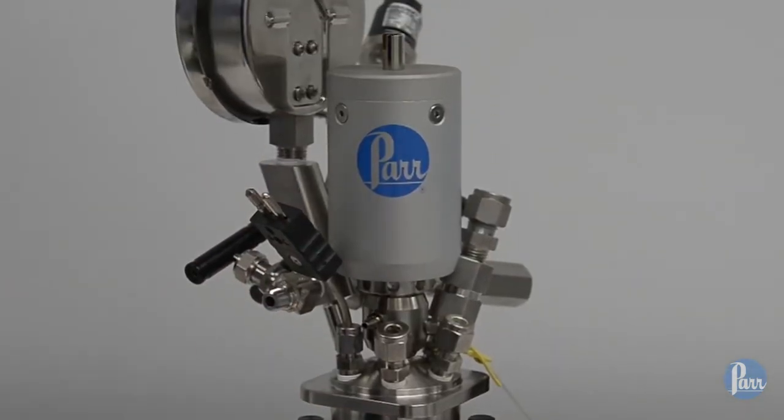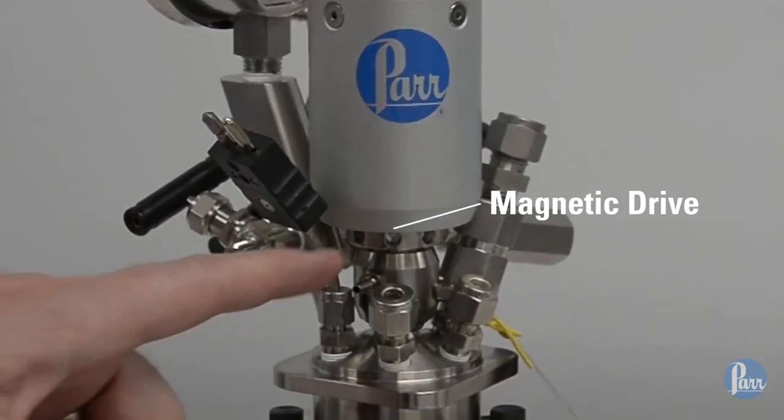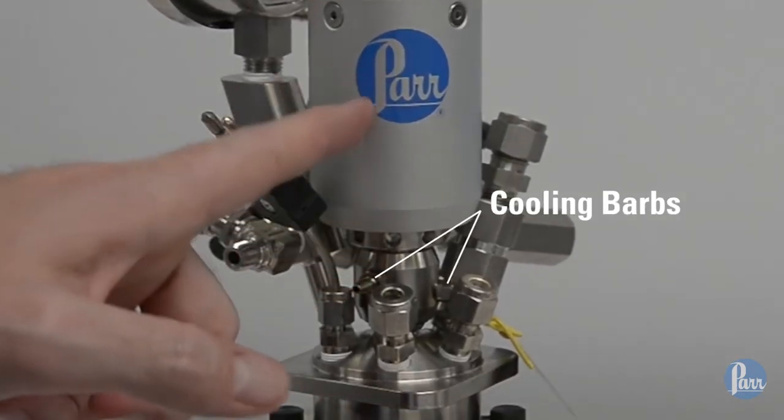Along with the central magnetic drive connected to the overarm with cooling sleeve barbs to keep the magnets cool inside the magnetic drive. What you've seen today is the standard head configuration for a Parr reactor.